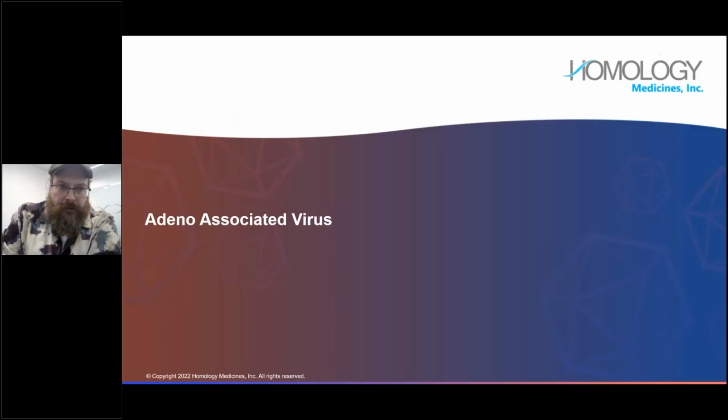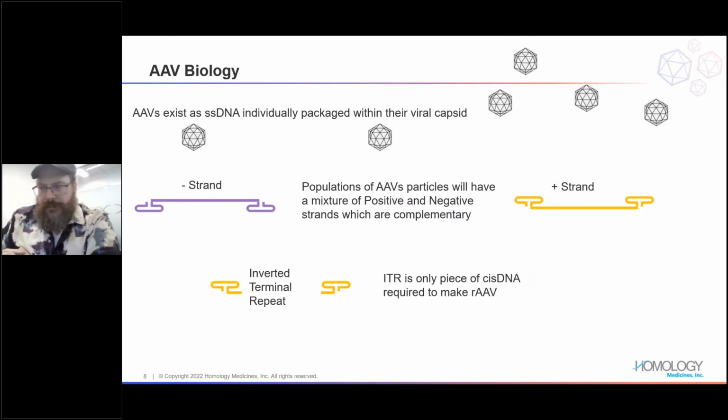So again, to shift gears and go back to what this applies to in what we're trying to fix here with our AAVs. A bit of a review from where we're coming from on the virus. They're packaged as single-stranded molecules of DNA. You get a roughly 50-50 mix of positive and negative strands, as these things are unwound essentially in their host cells from a plasmid, because we're working with recombinant, and then we're of course stuffing them into their capsids.